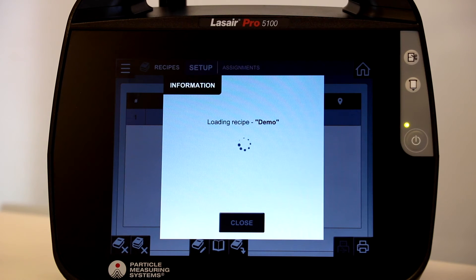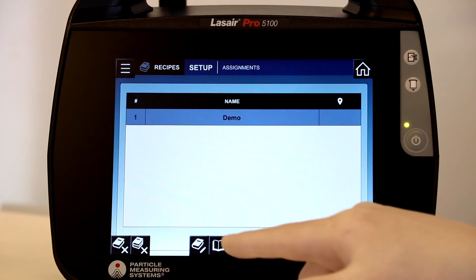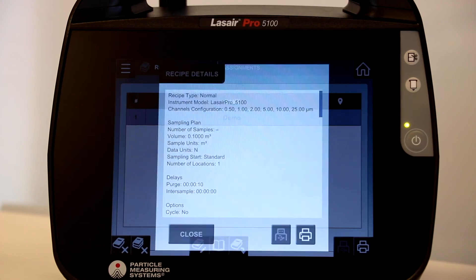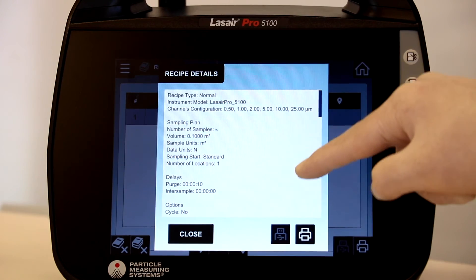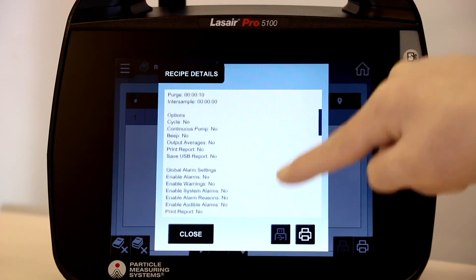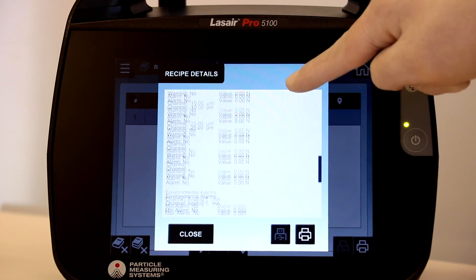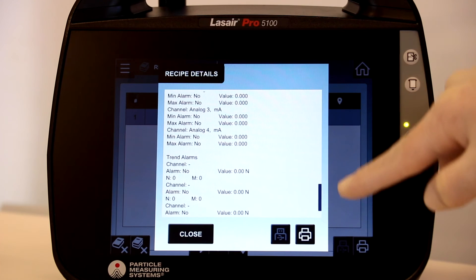From here, you can also review the recipe that has been loaded by selecting the recipe button. Here, the recipe will display for review. You can also print the recipe settings from this screen.